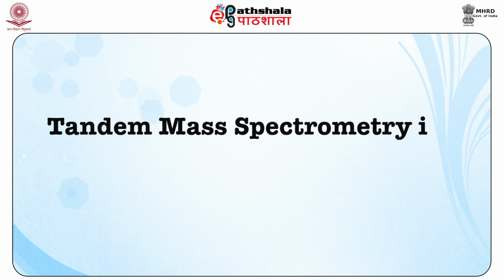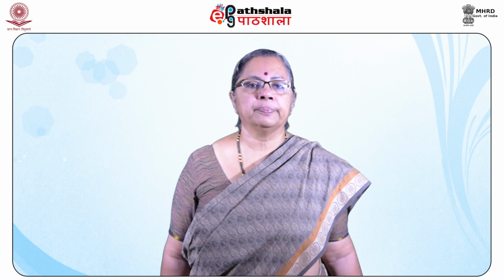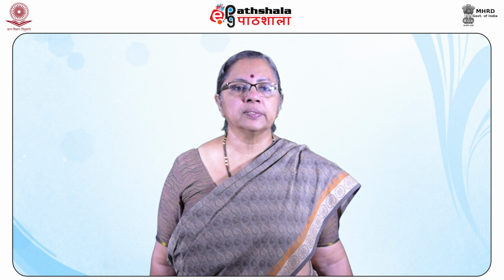Let us look at tandem mass spectrometry in sequencing peptides. Initially, a larger peptide is fragmented with an enzyme or randomly to generate random overlapping fragments.